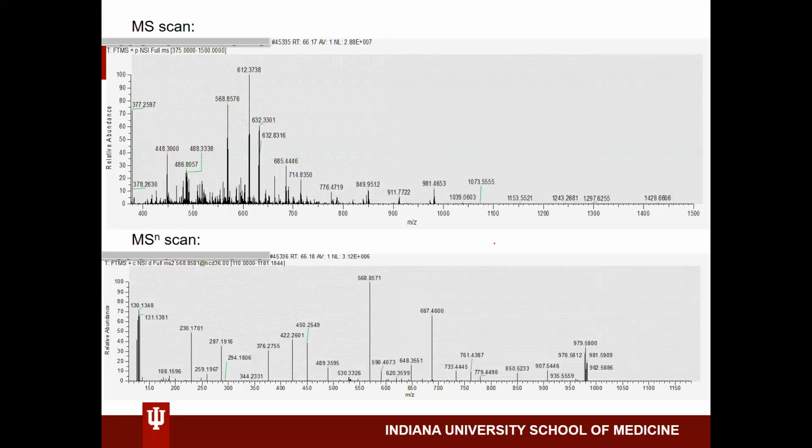So yeah, you can get a lot of different information from your raw file, and if you're running some specific experiment on a single protein or a set of small molecules, for example, you might want to practice looking at the raw files directly, because it could be something that would be really important for your data analysis. However, in large-scale proteomics experiments, these raw files are really complex, and you're not going to be able to just look at this precursor and fragment ion and determine what peptide it goes to. So later on, we're going to talk about some of the different data analysis and visualization software that are available out there.